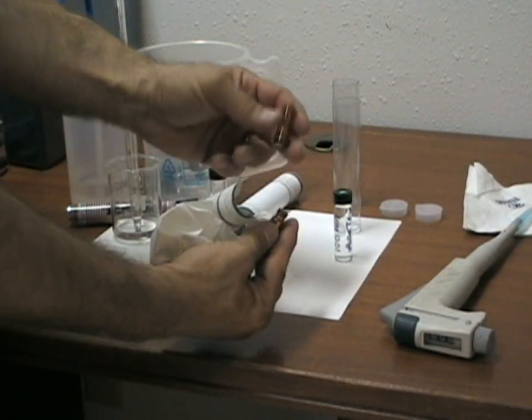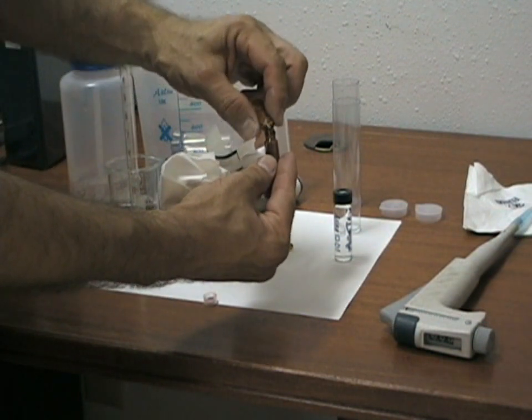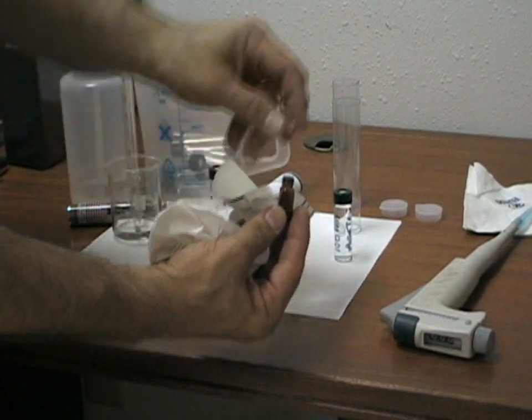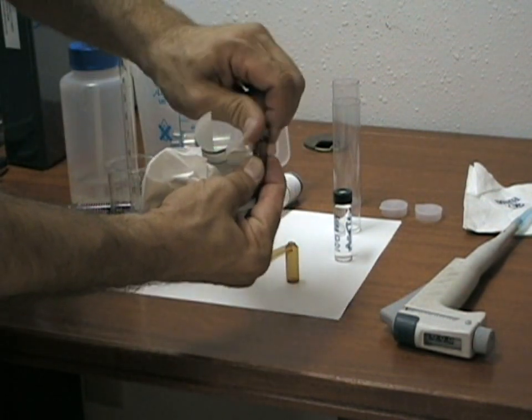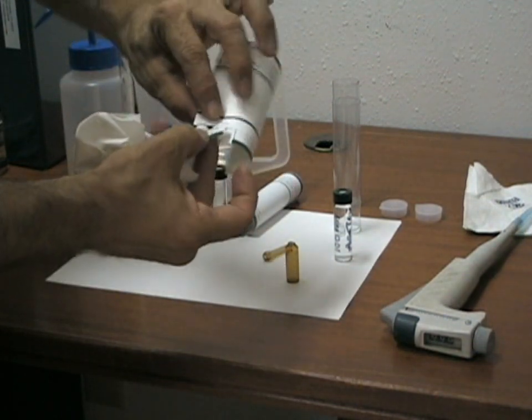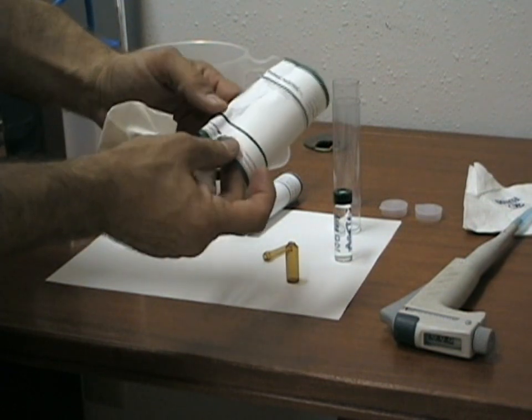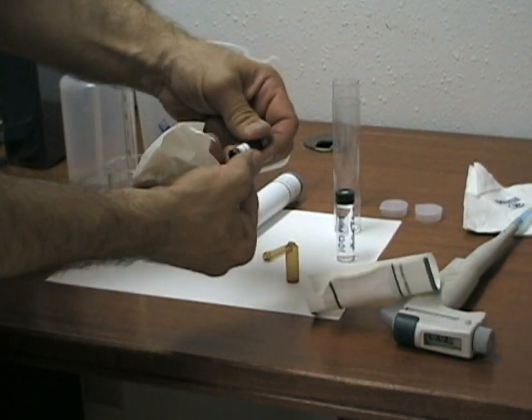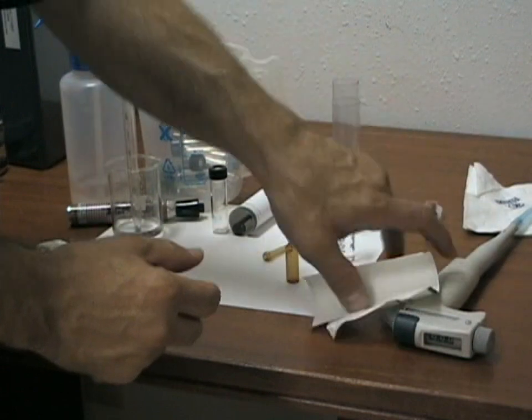You can also pour the remaining half milliliter of the concentrated standard into the small screw cap vial and again keep in the refrigerator for future use. A small label is included and comments can be made on the vial as well.